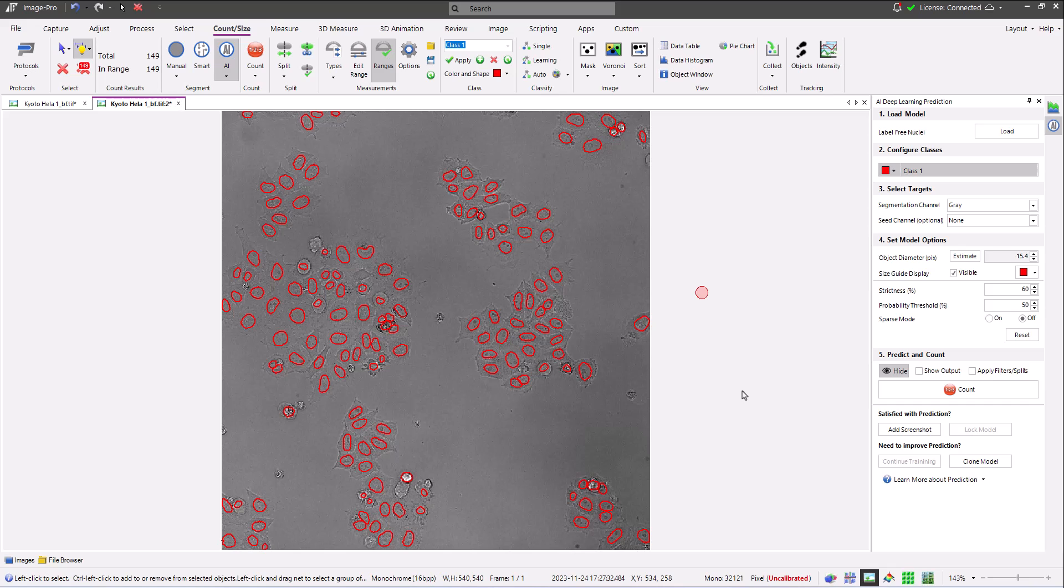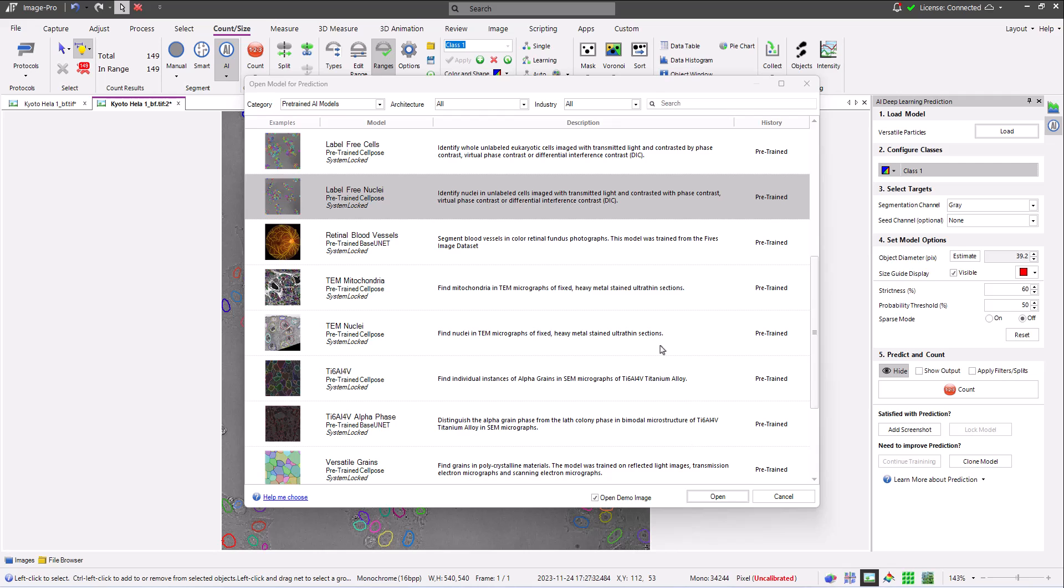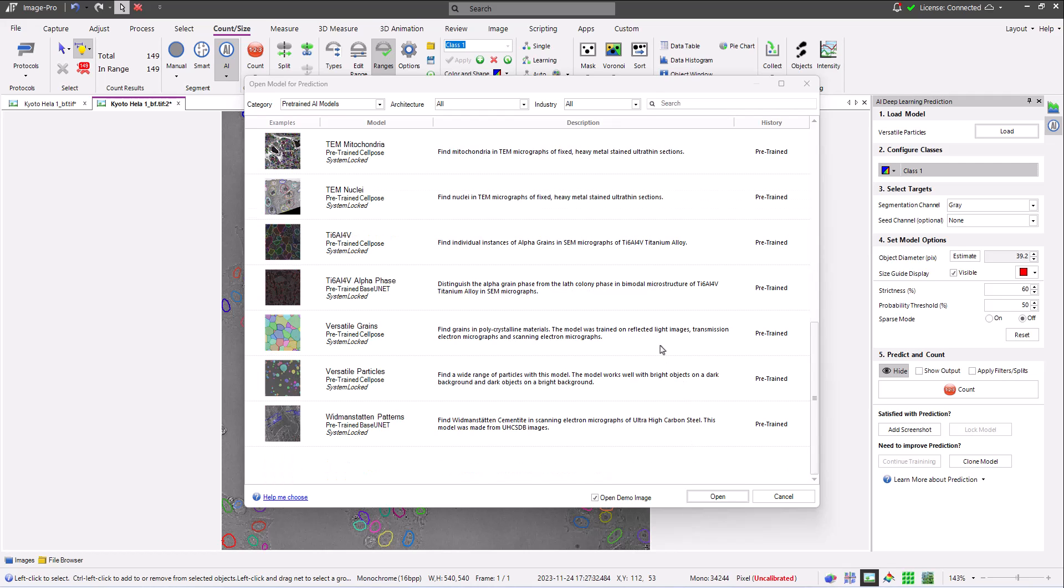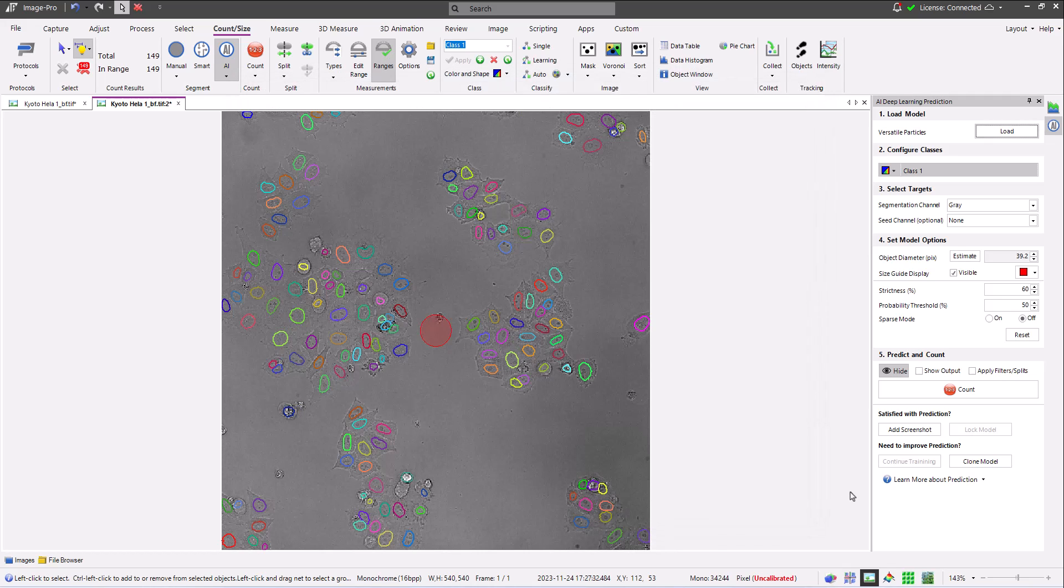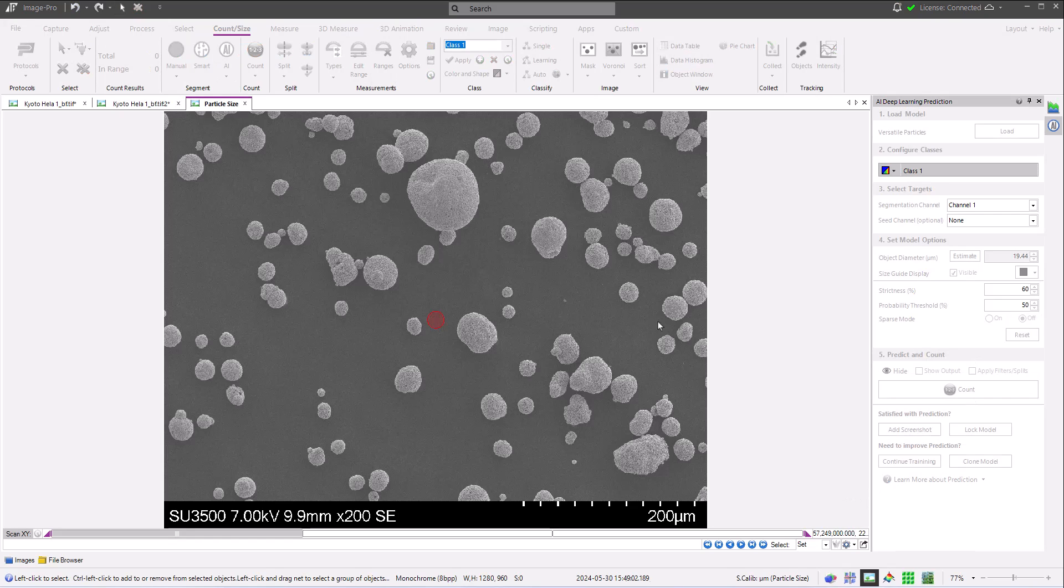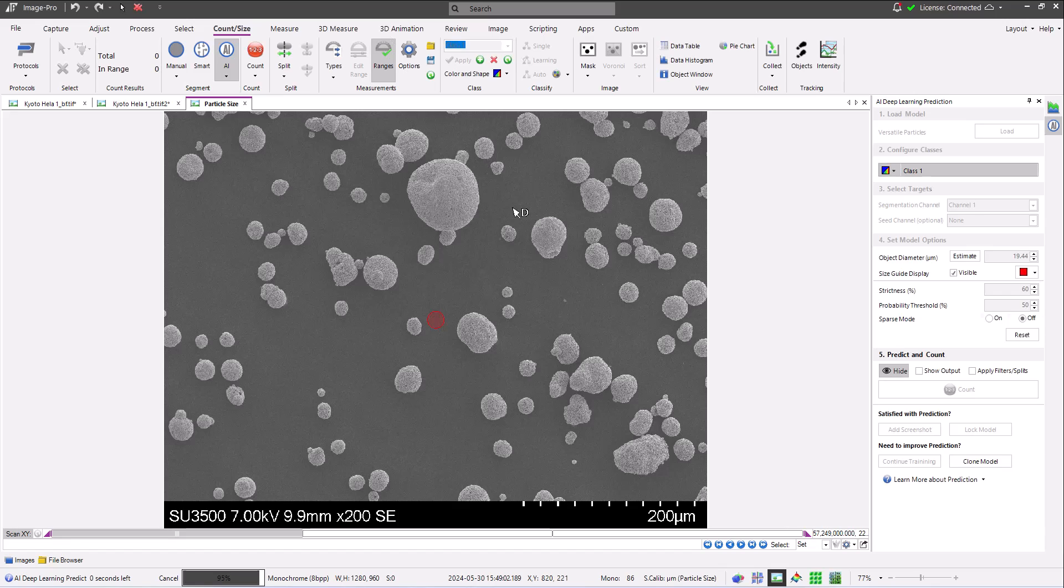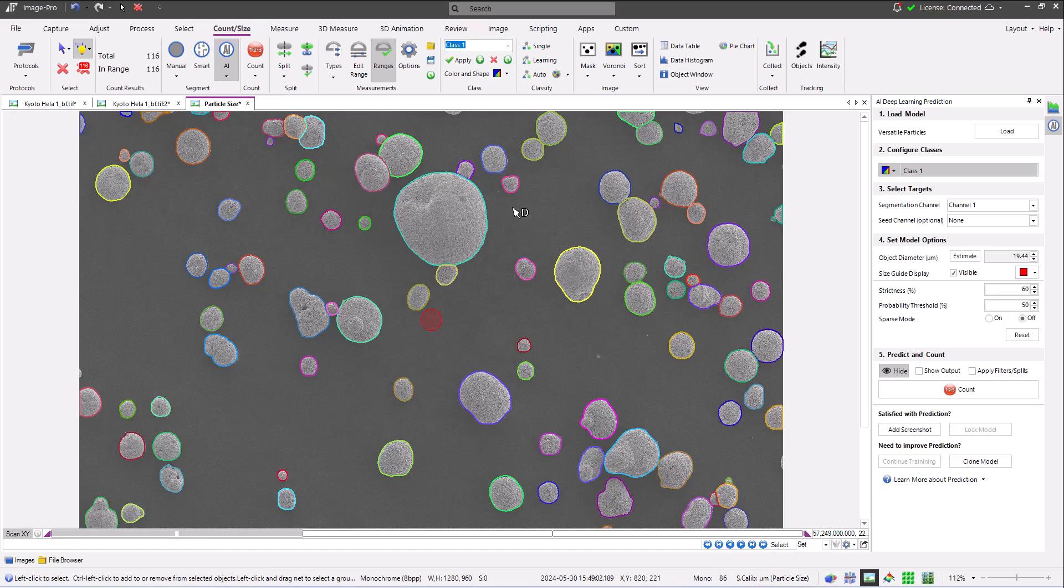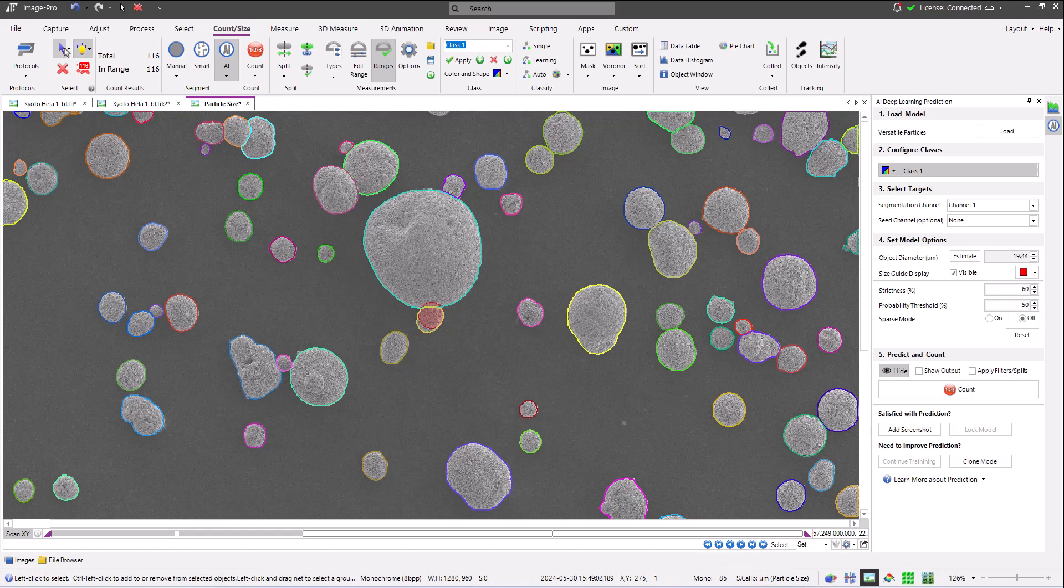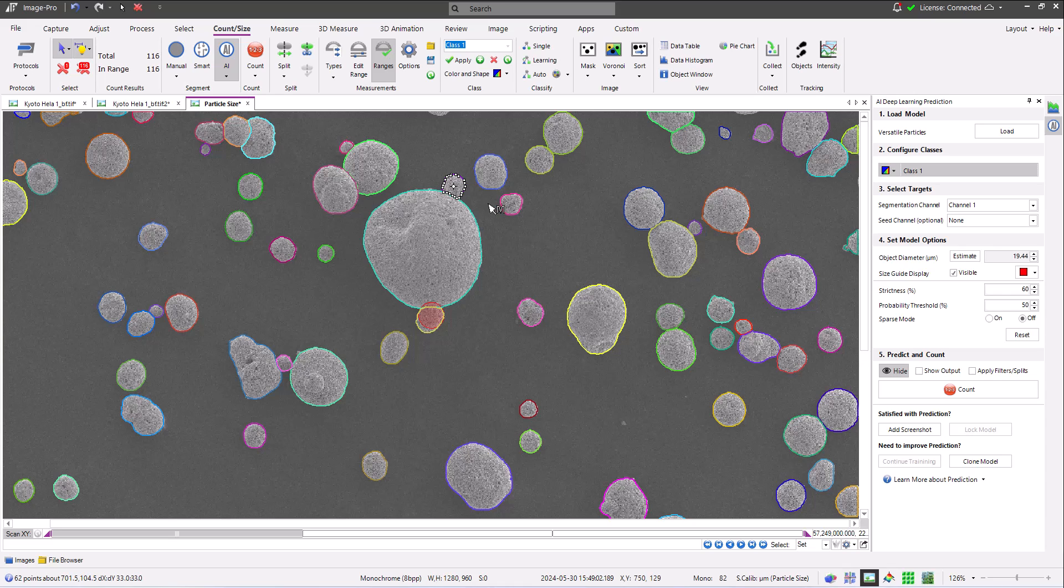Now let's look at some examples of material science models. First, I'm loading the versatile particles model and counting. Please note the success the model has in segmenting each particle in the image and separating each from its neighbor.